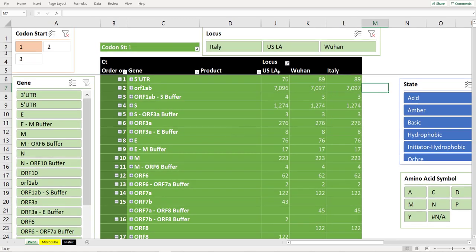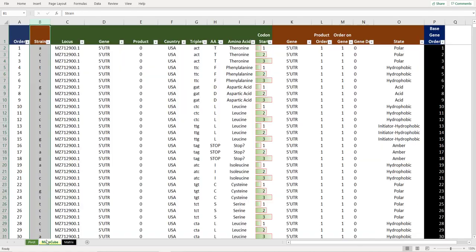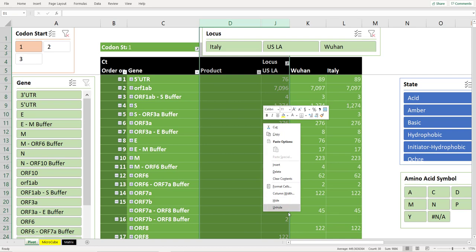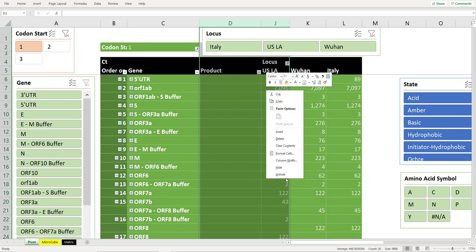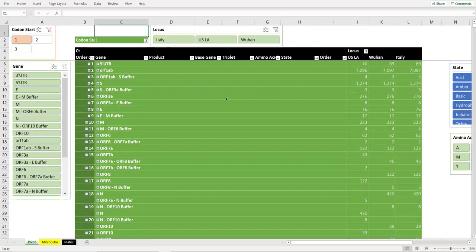You can add any accession strain, any number. We can just add them to this list and bring them in, and then run them into this cube and basically analyze them like this. So what are we looking at, and why is this really, really cool? Well, there's a lot of things hidden in here, and I'll show them to you in a minute. They're hidden right under here, which is different attributes of the amino acid and the order of things.